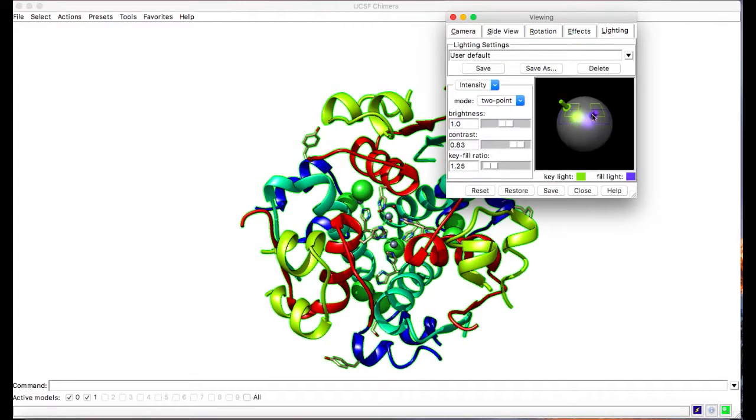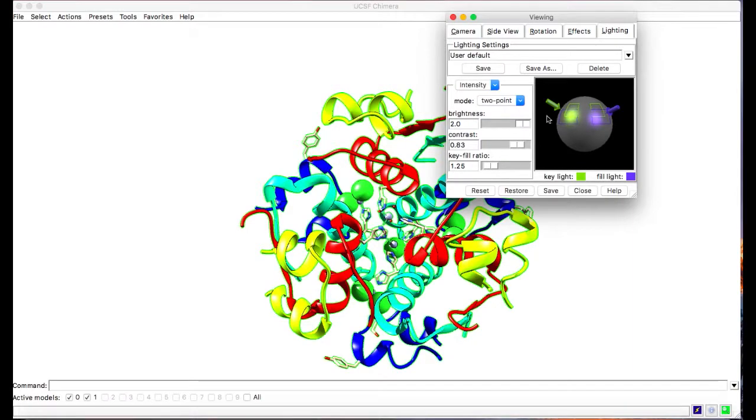Okay. Lighting. There's actually a fill light and a key light. So if you put both together, as you can see, it looks like just one big light shining. Having two lights basically allows you to lower the amount of shadows that you have. Okay, let's put this away a little bit like this. Perfect. Change the contrast and brightness. Put it back to 1, the stock contrast.